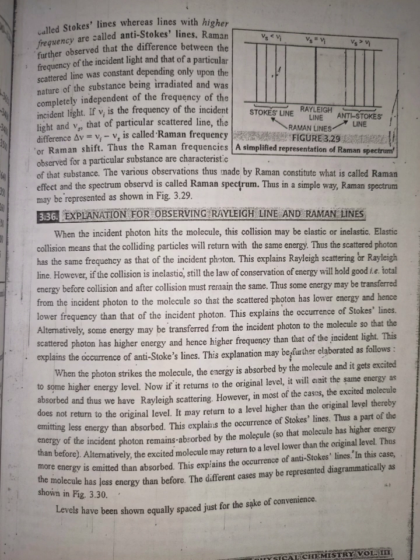Thus, more energy is emitted than absorbed. This explains the occurrence of anti-Stokes lines. In this case, the molecule has less energy than before. The different cases may be represented diagrammatically as shown in figure 3.30. Levels have been shown equally spaced just for the sake of convenience.